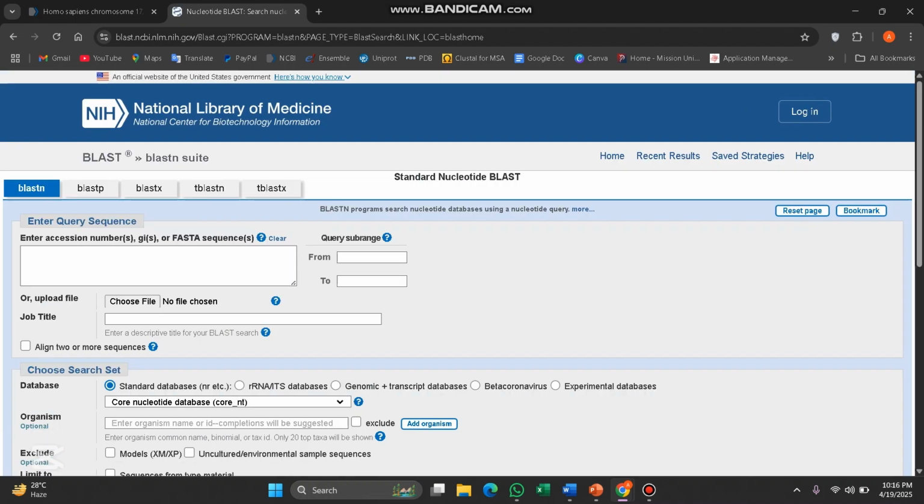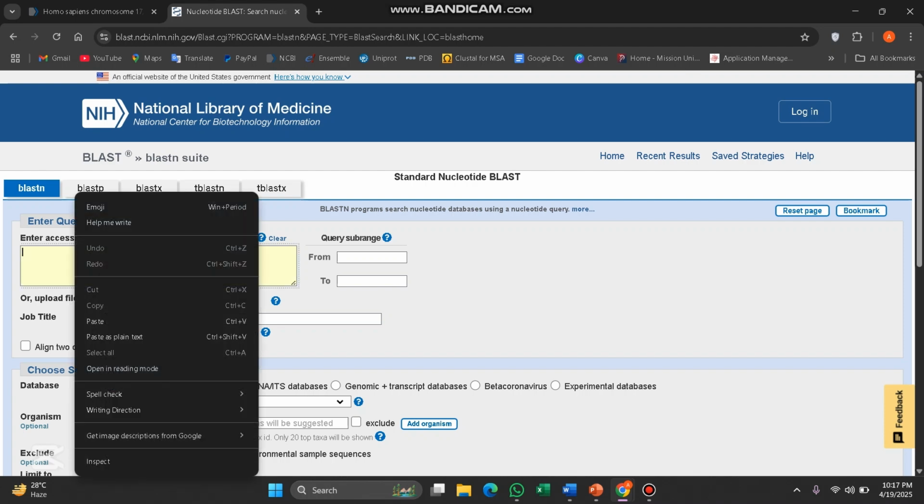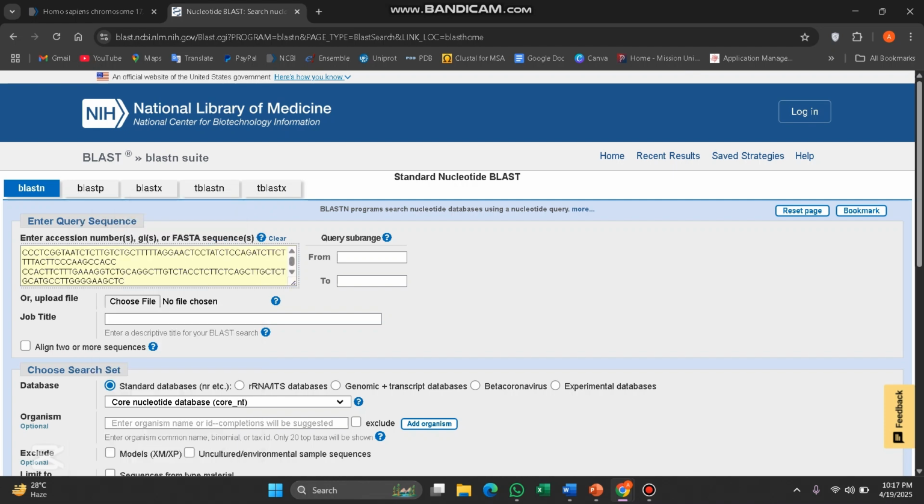So, what is BLAST? In NCBI, we can write in the search box the gene, the author name, the SNP, the nucleotide. But if you have a sequence, like the sequence we copied, and you want to know which species has this sequence, for this purpose we use BLAST.